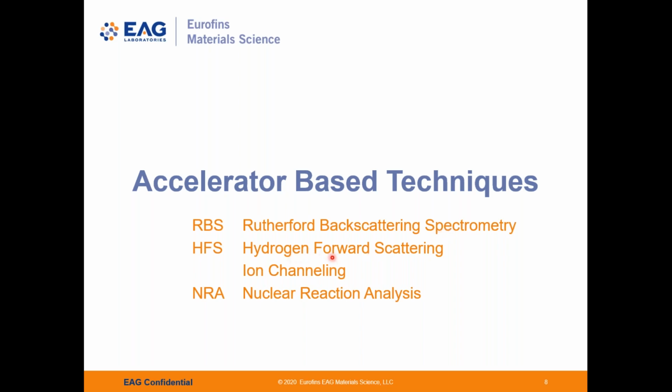HFS stands for hydrogen forward scattering. NRA stands for nuclear reaction analysis. The accelerator techniques are based on collisions between atomic nuclei, and RBS derives its name from the physicist Ernest Rutherford, who was among the first scientists to pioneer the concept of atoms being composed of nuclei surrounded by electrons.